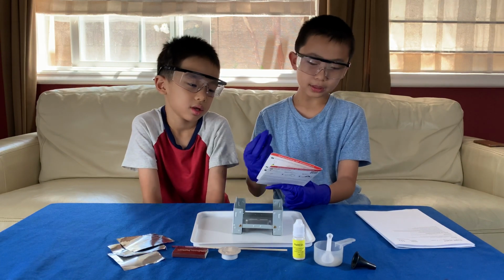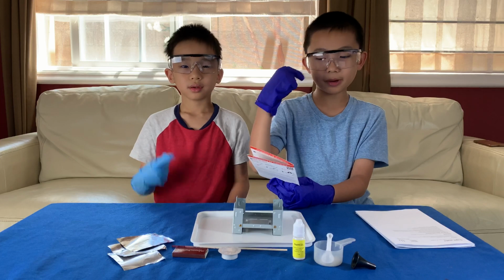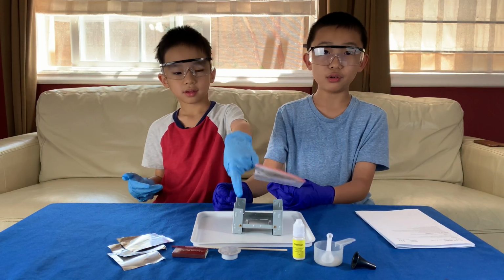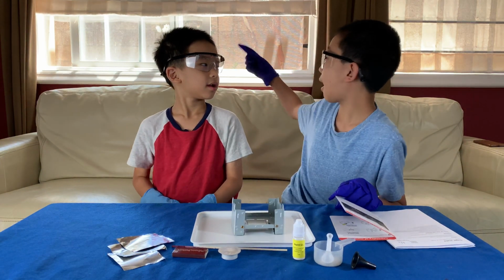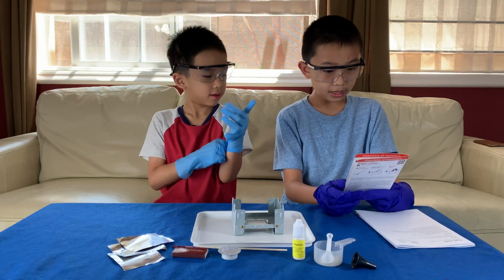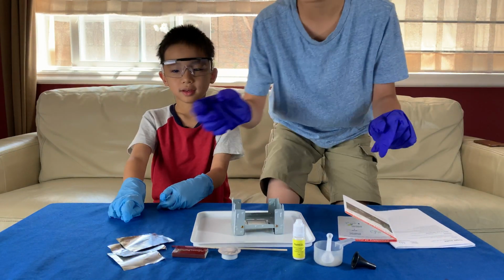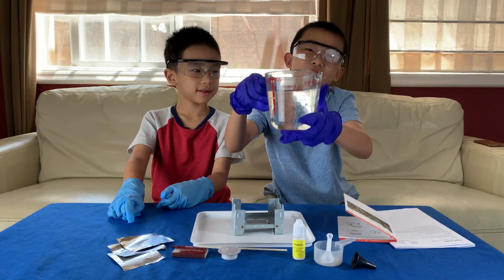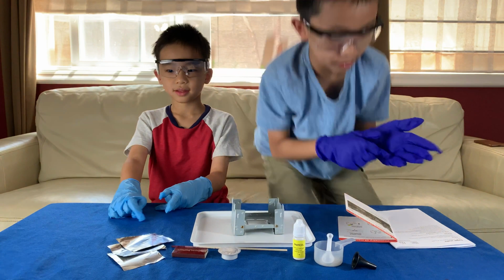So there's 3 safety things we have to do. First is put on protective gloves and eyewear. We have that. Conduct the experiment on the plastic tray and in a well-ventilated area. Plastic tray, well-ventilated area. It's also a big room. And then keep a bowl of water nearby when working with fire. I'll carefully get this to show you guys that we have a big bowl of water just in case the fire gets out of hand. Okay, but it probably won't.